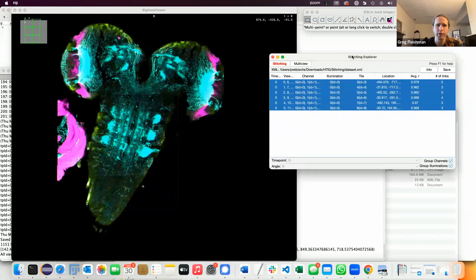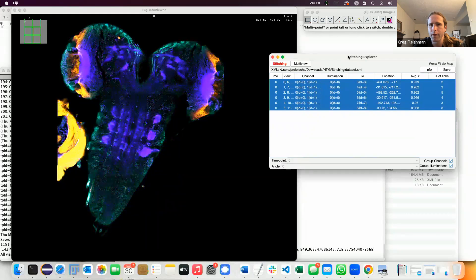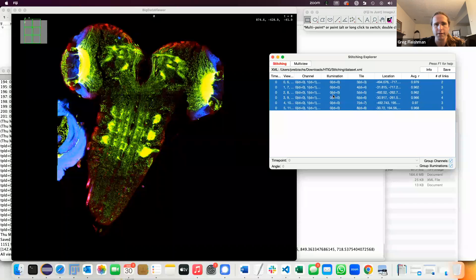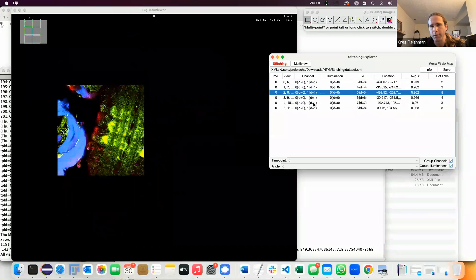Second opinion: I completely agree with Stefan — images are usually oversampled with respect to the features you actually want to line up. The things you'd look at as a human to decide if it's lined up are at least 10 to 15 voxels in size. Aligning at full resolution just gives the algorithm lots of opportunities to find bad matches because of the noise.